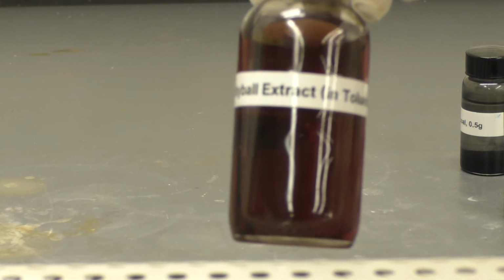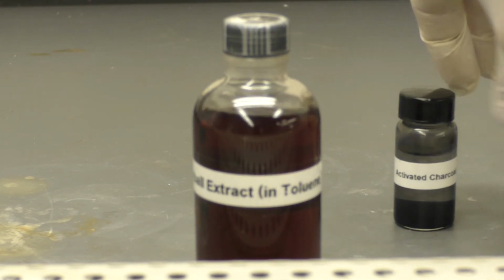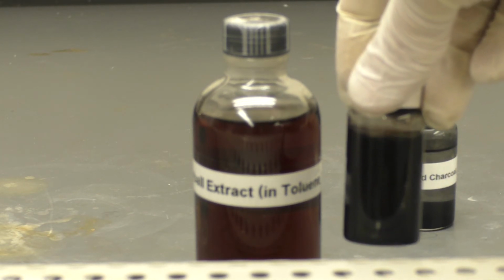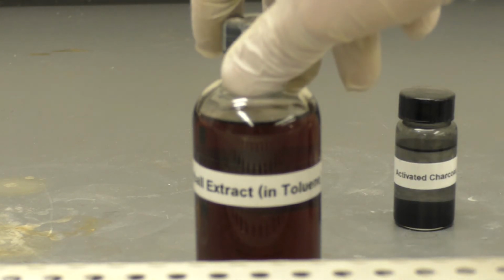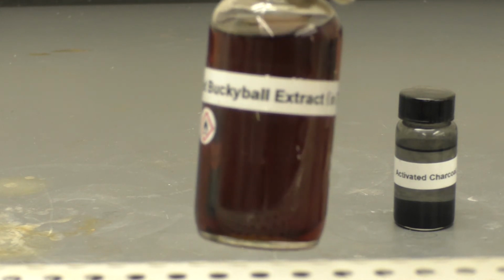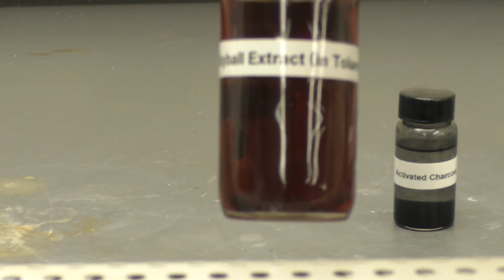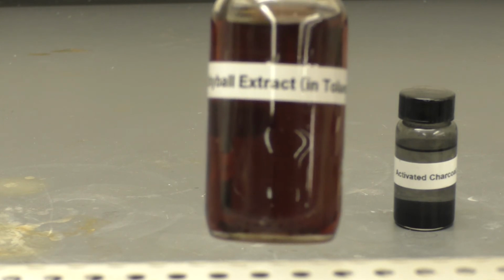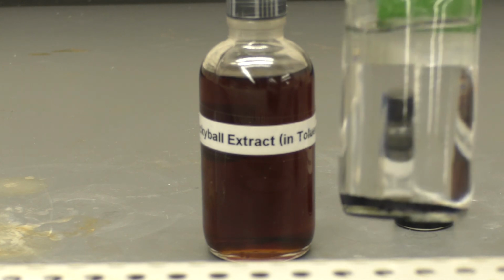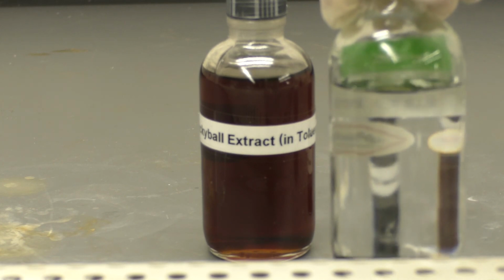So here is even a better representation. We took essentially the Buckyball extract from something like this, which is still kind of cloudy because a lot of the fine particles of soot haven't settled out, and filtered it, and this is what you get. So this is the sort of wine-colored Buckyball extract, and toluene has a really nice color. So those C60 and C70 little Buckyballs are now dissolved in the toluene, and you can see that is quite a bit different. Here's just a larger sample of the activated charcoal or the soot. No color. So that's indicative that something actually happened.